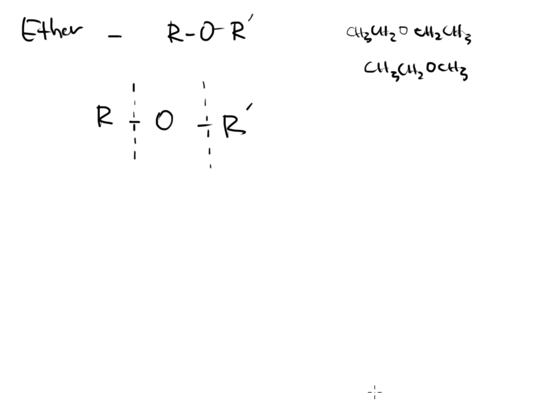All right? Again, keep in mind, chlorine and bromine are very electronegative. Well, you know, oxygen's electronegative as well. So if it does cleave on this side, and I'm going to get rid of the other one for now, we'll do that separately on a different line so we don't get confused. Let's say it cleaves to the left. Oxygen is electronegative. So this is the piece that gets the negative, and the remaining piece over here will get the positive, and this is what gets picked up by the mass spectrometer.